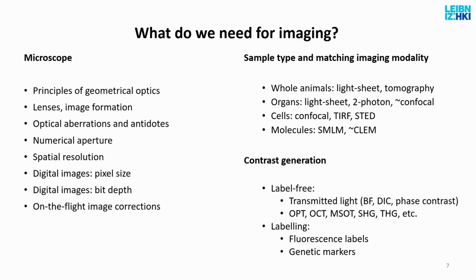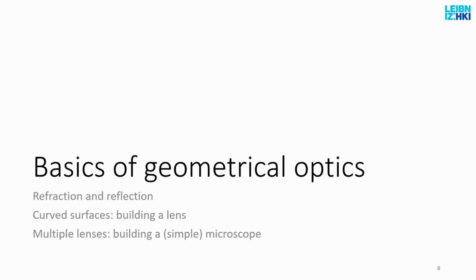And I will try to go through these as quickly as possible in the next 2.5 or so hours. I need to teach you a little bit about the basics of geometrical optics to understand how a microscope works, which will then later help you to set it up, to know exactly what the microscope can do, how I should set it up, and why I should do it that way.